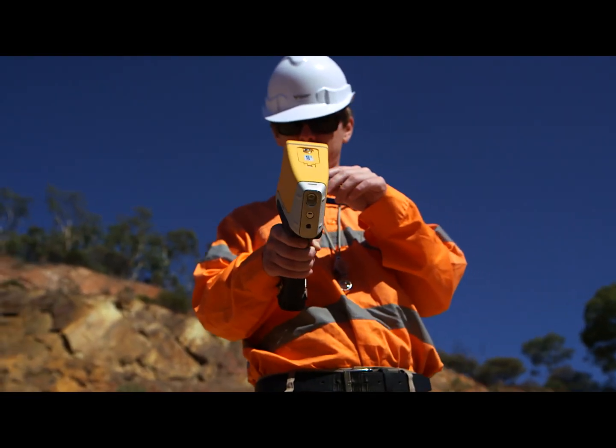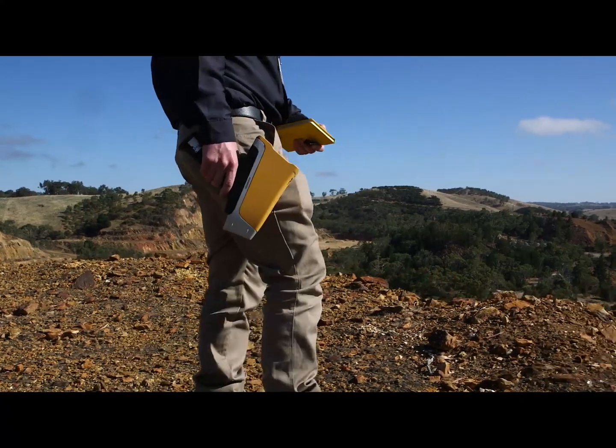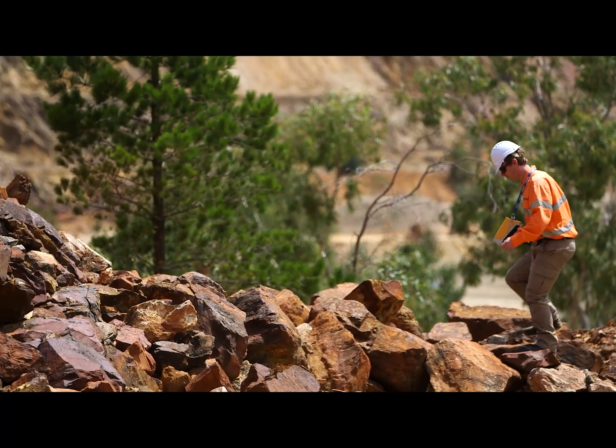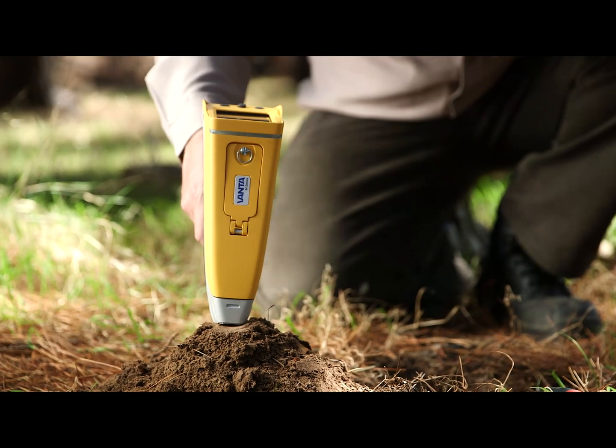Yeah, but it's very important to remember that your standard operating procedures should be part of your goals and objectives. Everyone should be there on the same page, so there's no ambiguity with your testing procedures. I completely agree. One of the things I always say when training a new customer is, do you know why you're taking that measurement that day? Have you understood clearly the objectives of taking those measurements each day and the value that that's going to provide the shareholders of the company? Making sure the customer understands that will ensure they optimise the instrument to achieve the objectives set out for it.